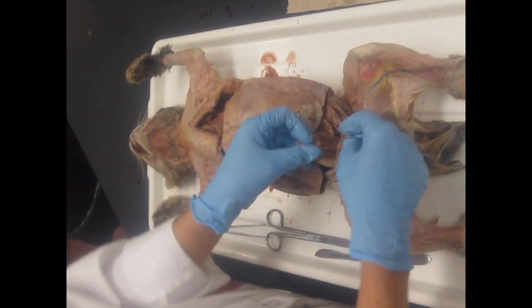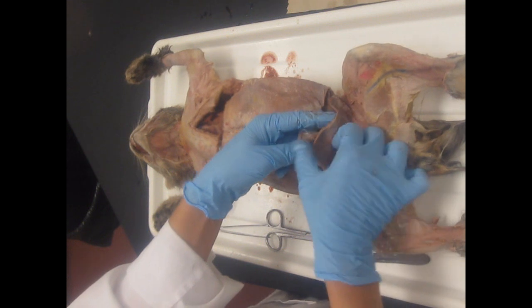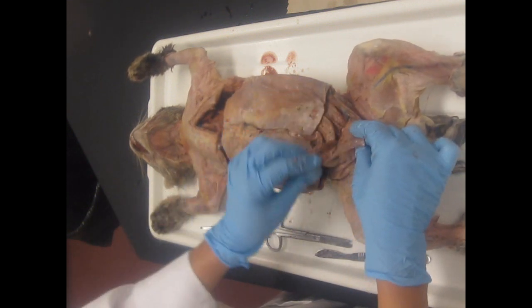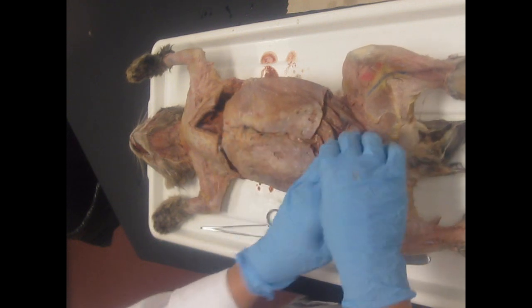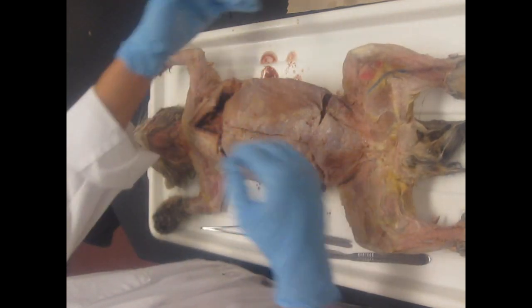Okay, if you lift this back, there's our urinary bladder. Nice sac. And it is attached to the abdominal wall with a ligament. This membrane here is called the median umbilical ligament. Do not cut that off. Okay. Alright, now the abdomen isn't open yet.